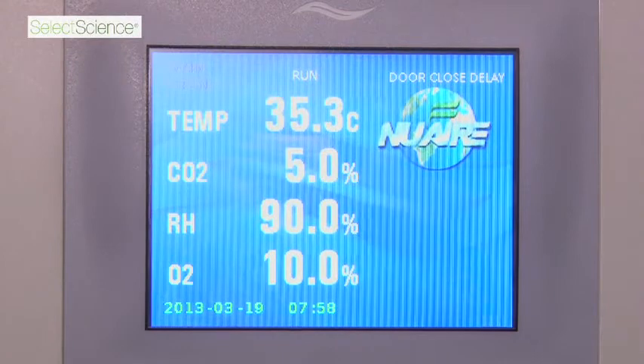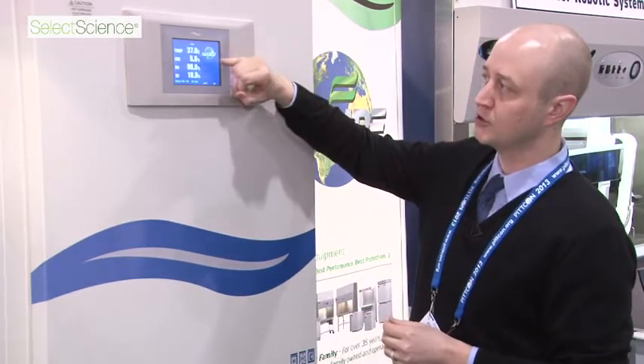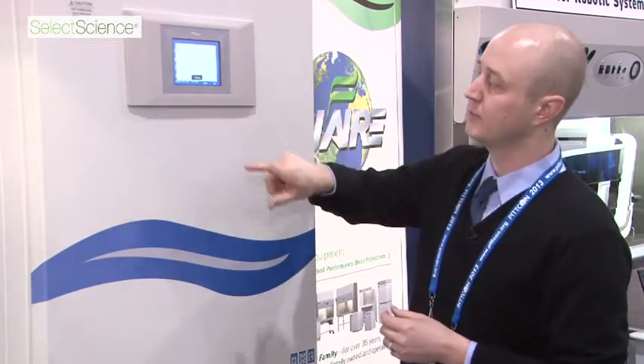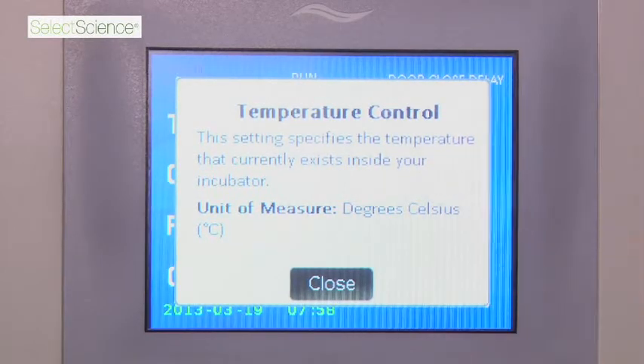This is the new touch control system. It is a color touchscreen, 5x7, very easy to use and very user-friendly. Here you can see temperature and CO2 displayed. This unit also has humidity control as well as oxygen suppression. If you are ever curious about what something is on this system, you can simply push temperature and it will tell you what it actually is — like this is telling you it is temperature control.